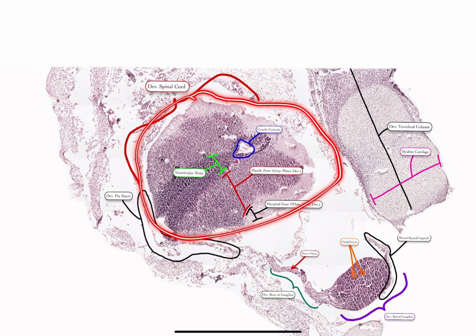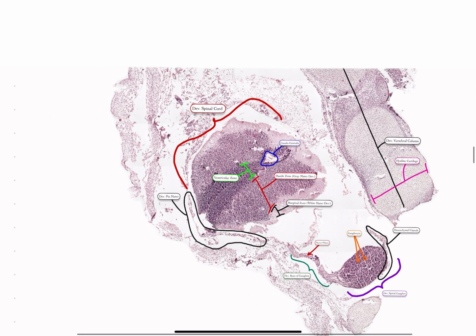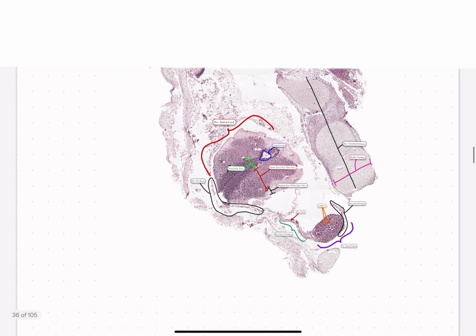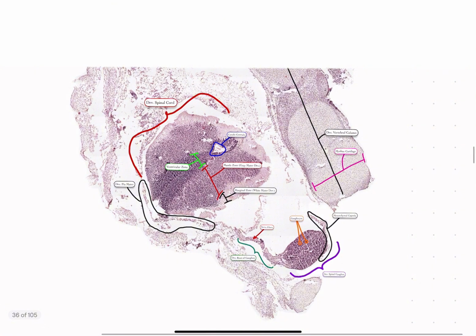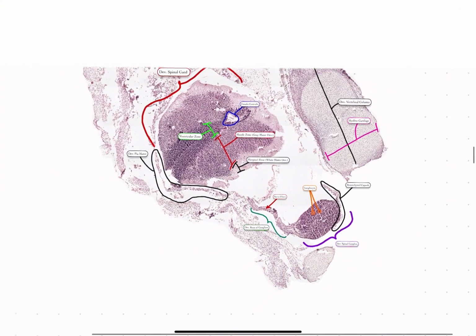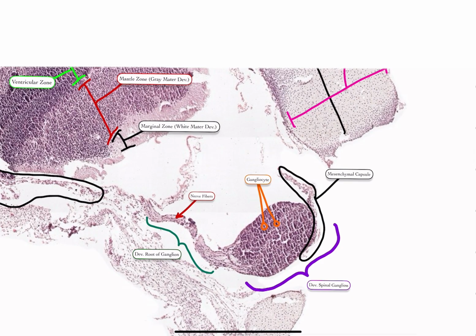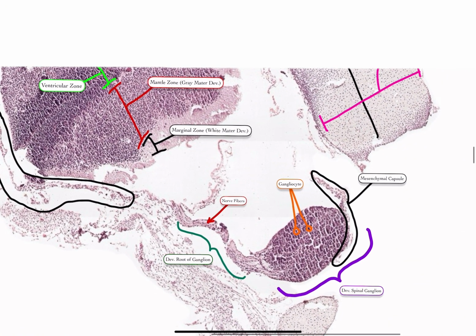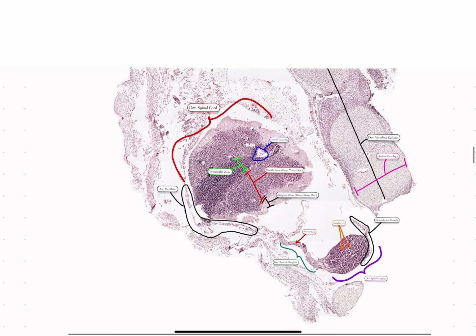Surrounding the spinal cord, we have this tissue called the pia mater, in this case the developing pia mater, and obviously, like I said, it is the spinal cord, so we will find it within or enveloped by the developing vertebral column. I'll show you what that looks like in a second. And as for a structure that we recognize from the previous colloquium, we can also find the developing spinal ganglion. And some professors point out that it is important to know different sections of the spinal ganglion. I say not so much, but they might change it in the future.